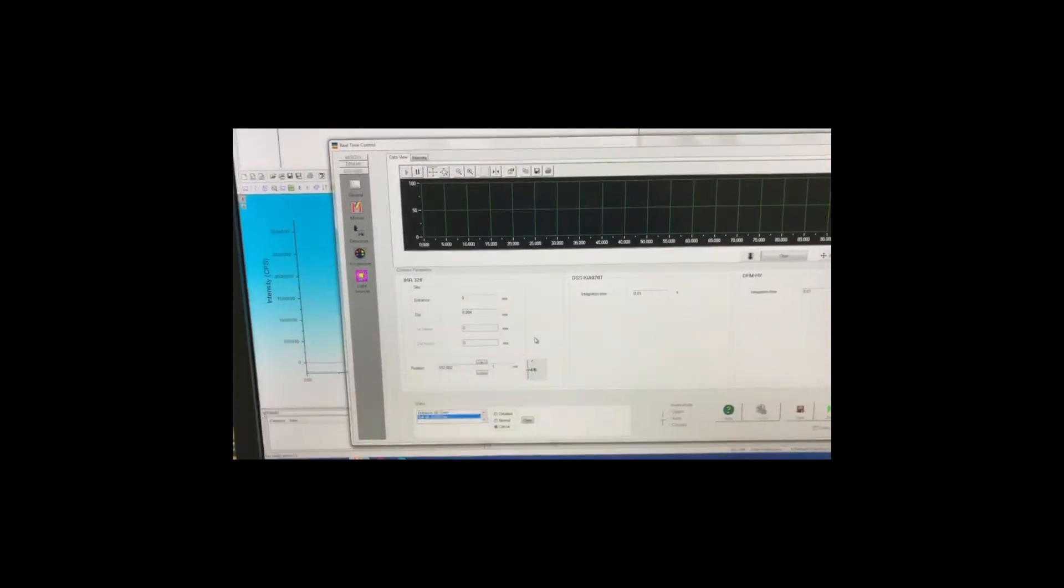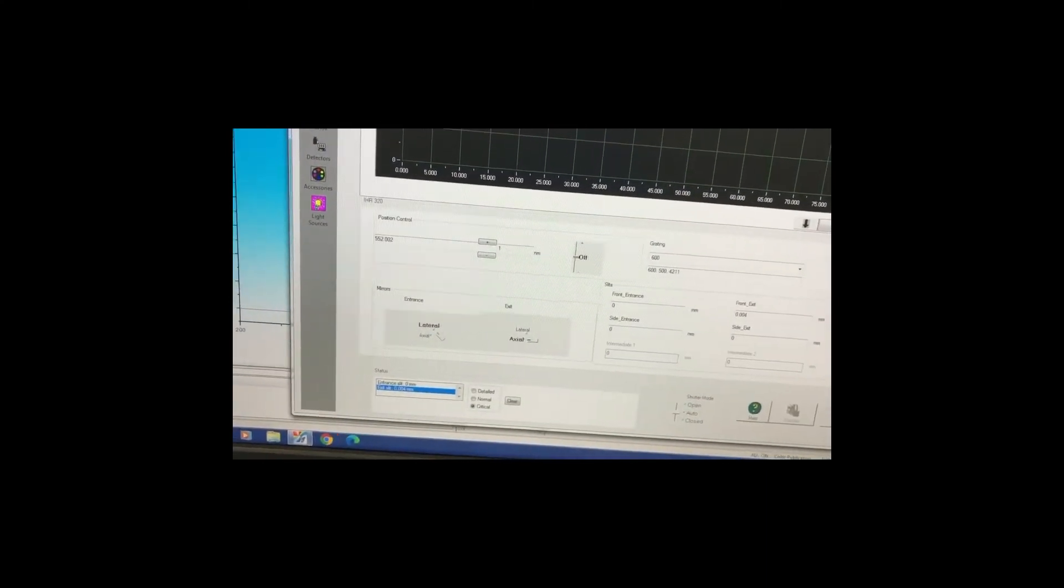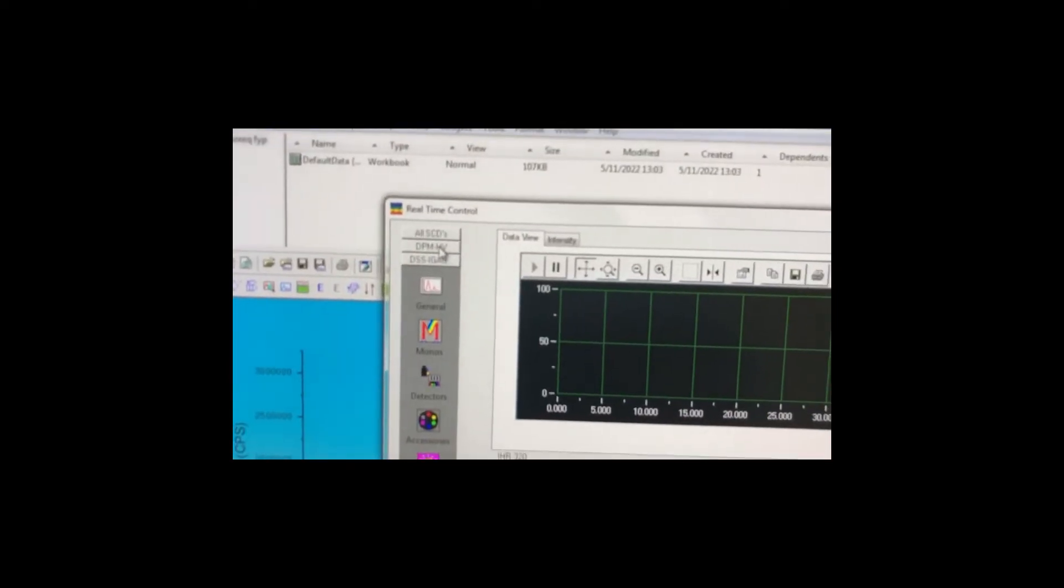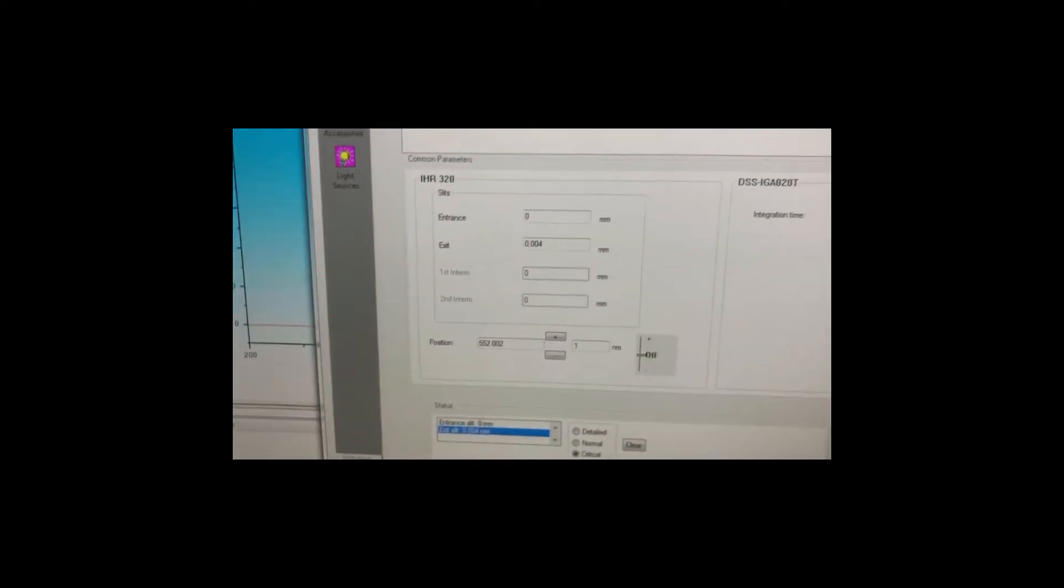The machine will move to position to 552. And then you click on the DPM or HV. Make sure that it is still 552 and then you click on the intensity.